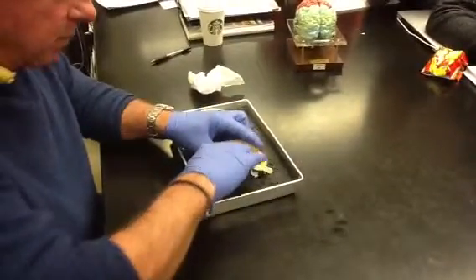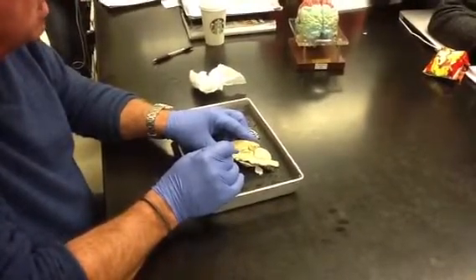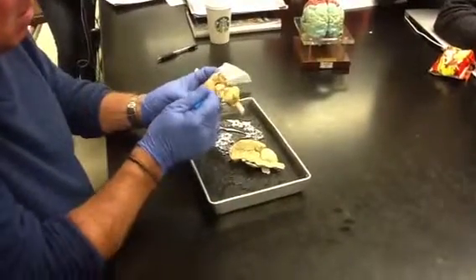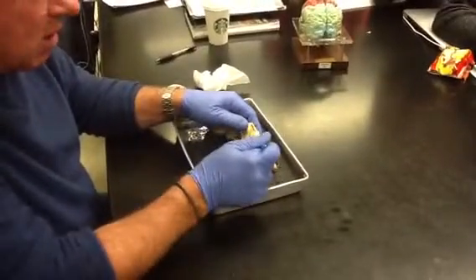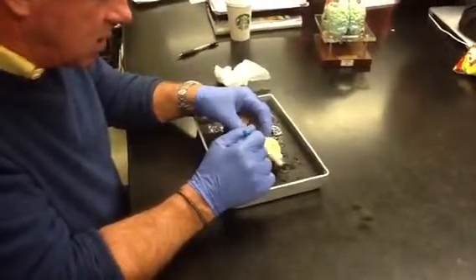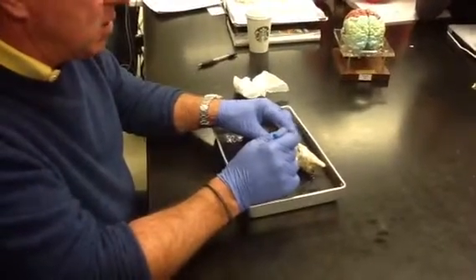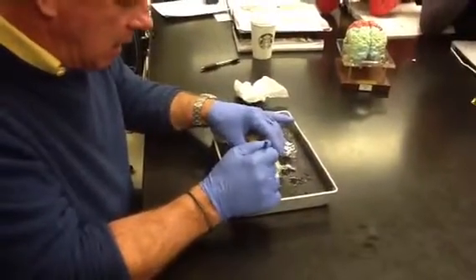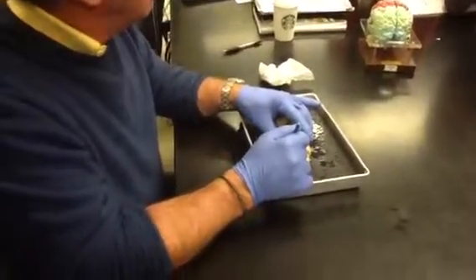And what else? Oh, now we did a sagittal cut. So this is the superior colliculus, and the area below it is the inferior colliculus, which was these structures here. And we can see half of the optic nerve right there. There's a little bit of dura still on this one. And this hunk of tissue right here that's still left hanging is actually the pituitary gland. And that might be about it on the sheep brain. I think that covers just about everything.